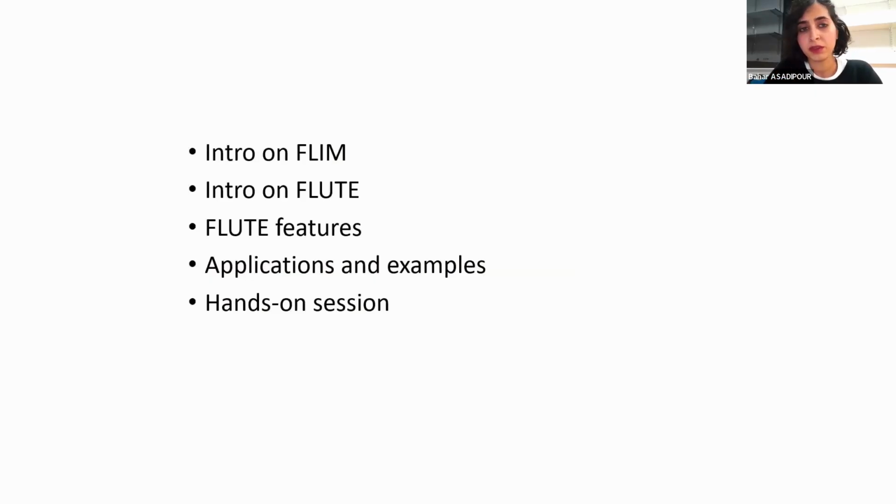So the outline is going to be first an introduction on FLIM, very basic, very fast, and then moving on to FLUTE and the features that it has, with the applications and some examples, and then we are going to move to the hands-on session.